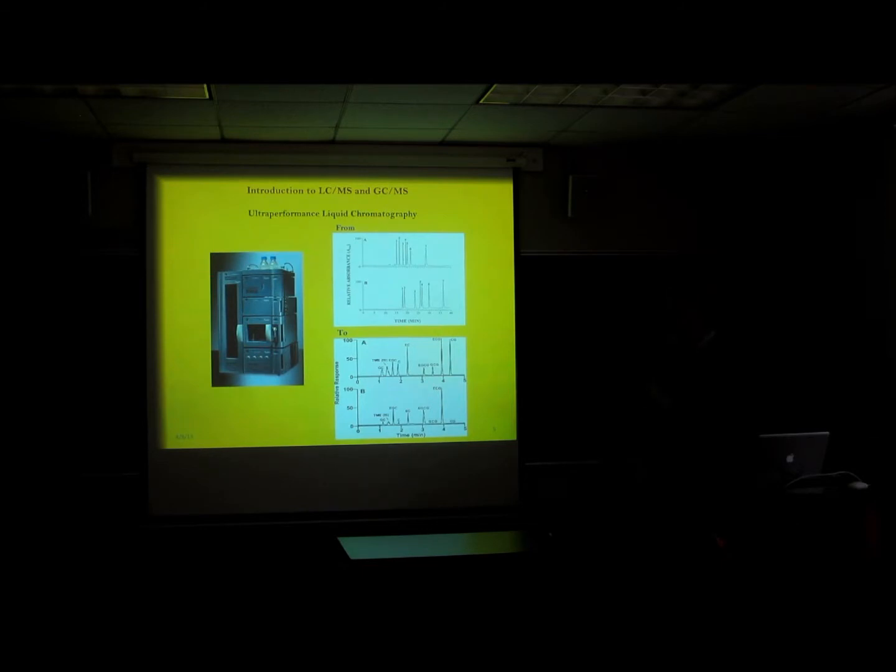What that has allowed, in a commercial, user-friendly benchtop liquid chromatography system, is to go to higher flow rates. You can go to smaller particle columns, which generate higher back pressures, but also give you higher resolution and more rapid separations over a shorter time frame.